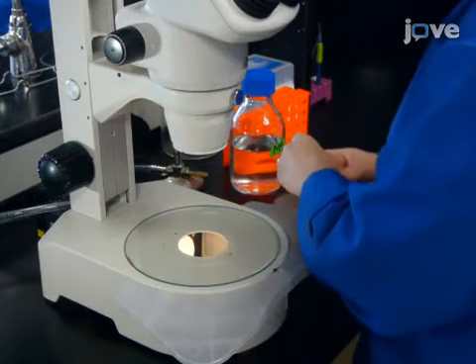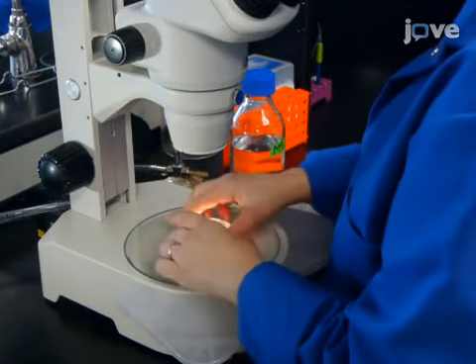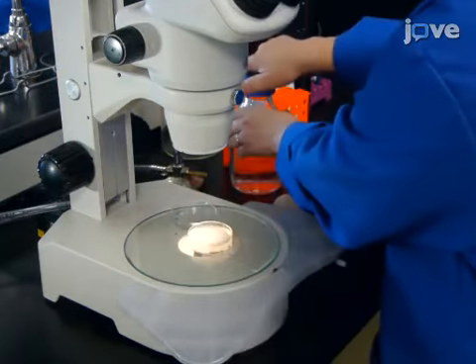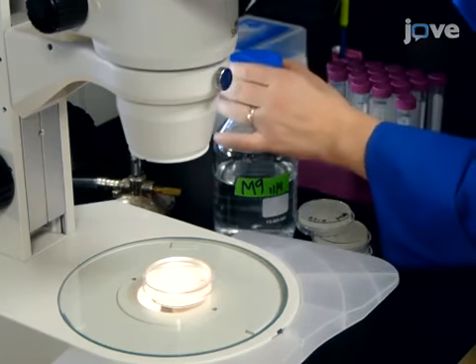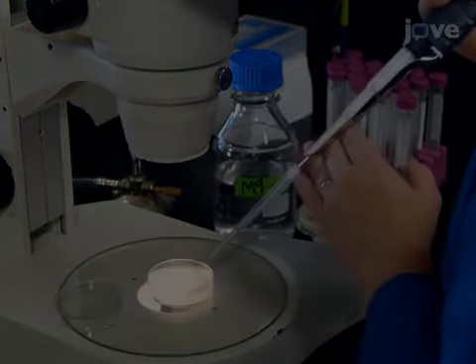The gravid worms for this procedure were previously prepared as described in the accompanying protocol text. Collect the gravid worms from the nematode growth medium, or NGM plates, by washing them with 1 to 2 milliliters of M.